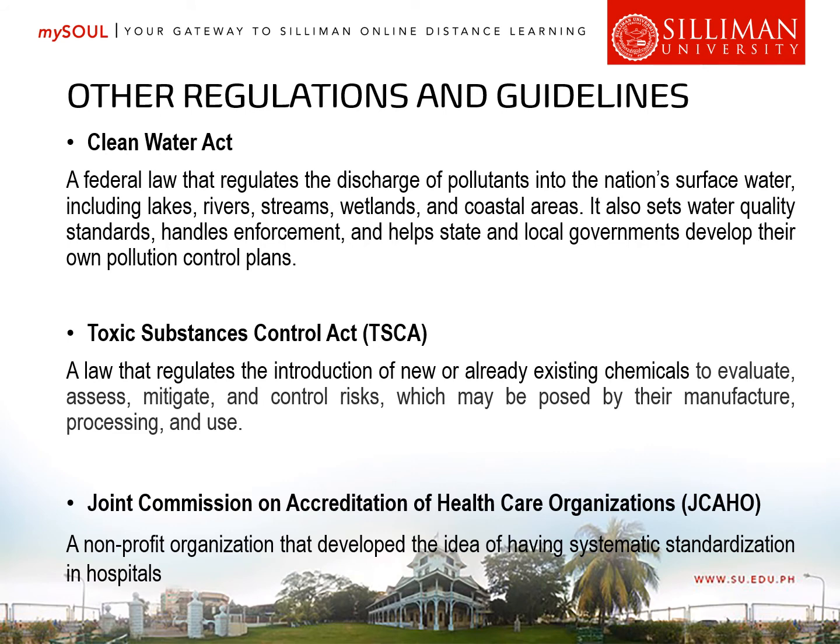Other regulations and guidelines that we need to know about, we have the Clean Water Act. This is a federal law that regulates the discharge of pollutants into the nation's surface water. That includes our lakes, rivers, streams, wetlands, and coastal areas. Because we all know there are also other big companies that dispose their chemicals into large bodies of water, and these chemicals not only pose a hazard to the people living near these bodies of water but also to the environment as a whole.